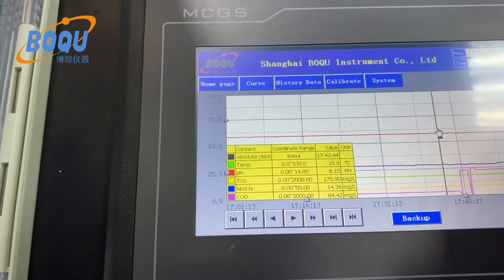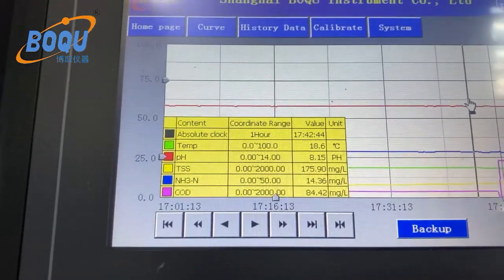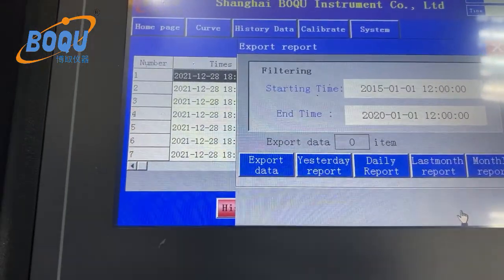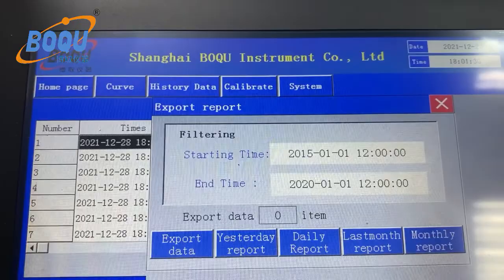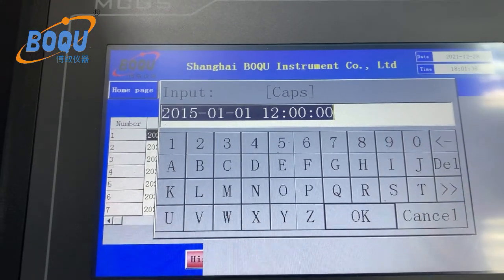Different parameters have different colors for different curves. You can also download the data by USB. You can choose a report: yesterday's report, daily report, monthly report, and you can also choose a custom time range according to customer need.